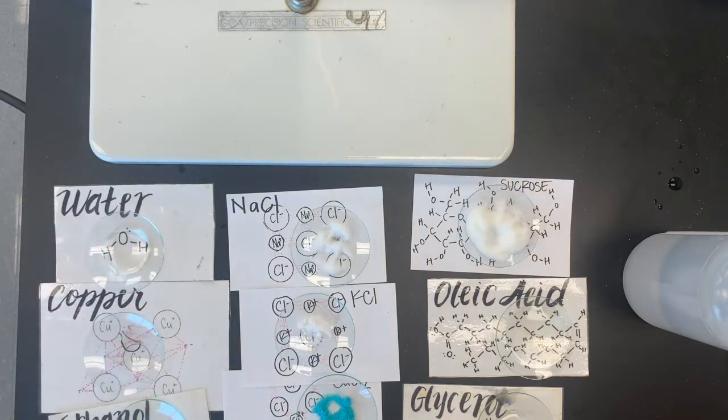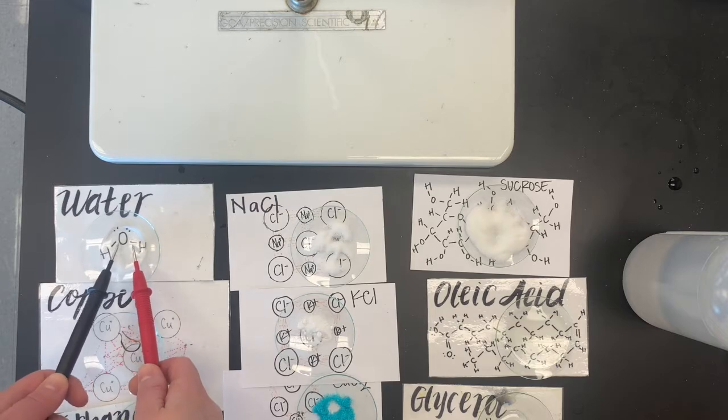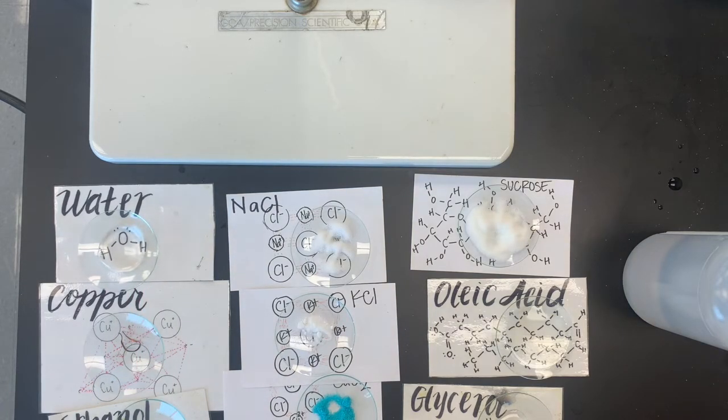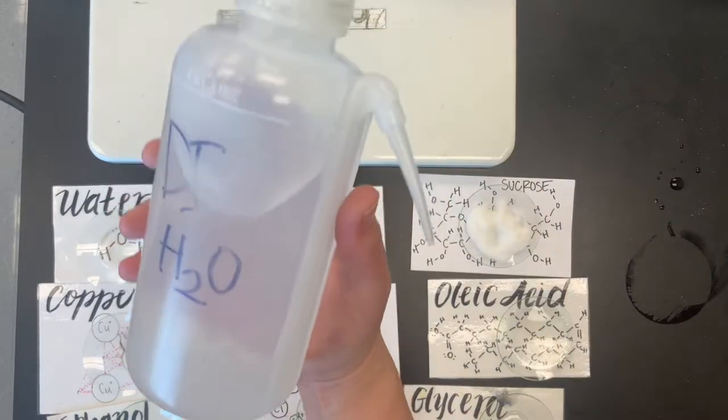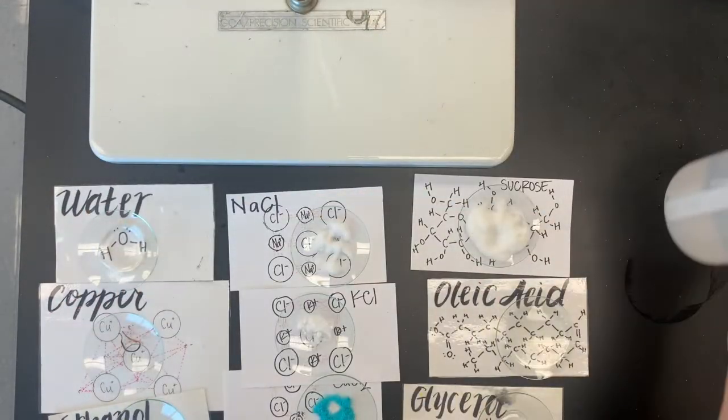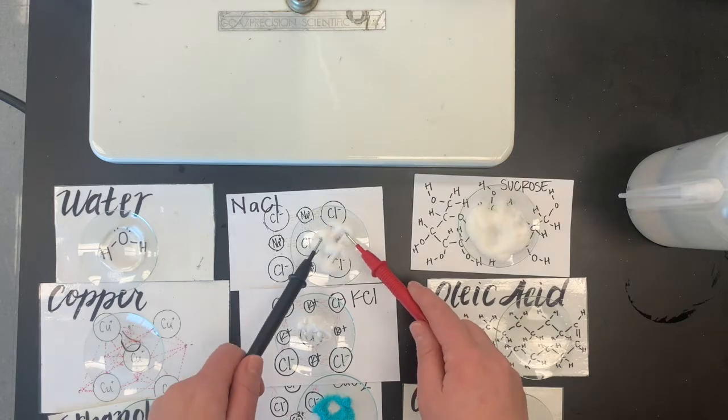Water. So just ask yourself, does water conduct? Yes or no? What do you think? So let's put these in here. Water does not conduct, this is pure water. What I have here, it's deionized water, meaning it has all of the ions taken out. So actual pure water does not conduct electricity. It's all the extra stuff in our water that does. So kind of fun fact.